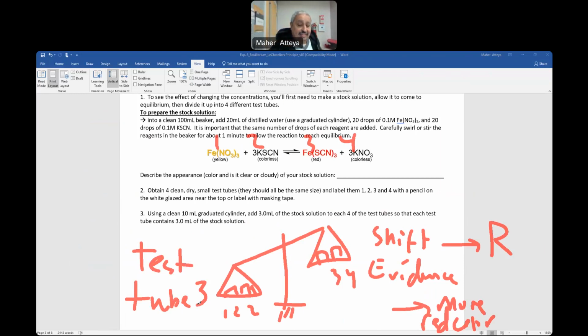Okay. Now we'll add number 4. What will happen if I add number 4? Where the picture will look like? I will draw it for you, but can you tell me which the answer will be? Test tube 4. I added number 4. So the heavier part will be where? To the right, correct? So it will be looking like this.